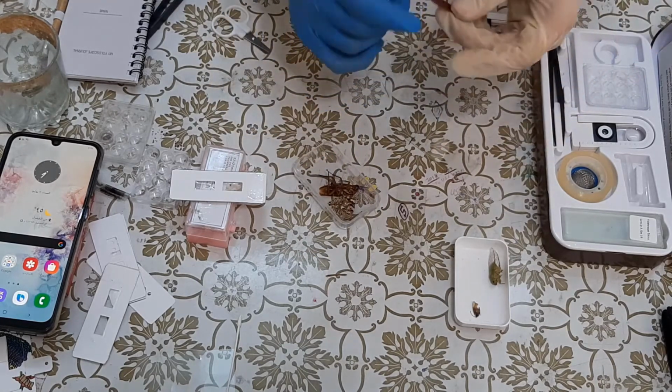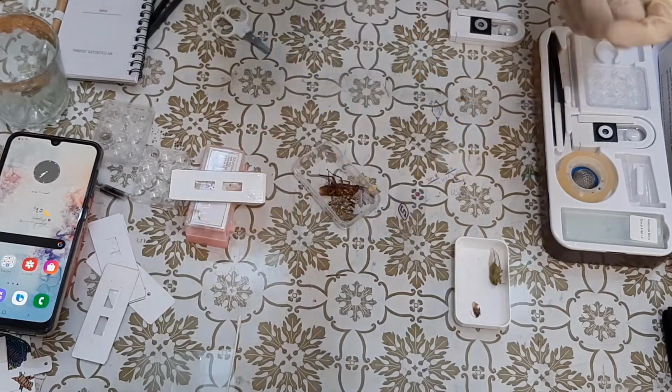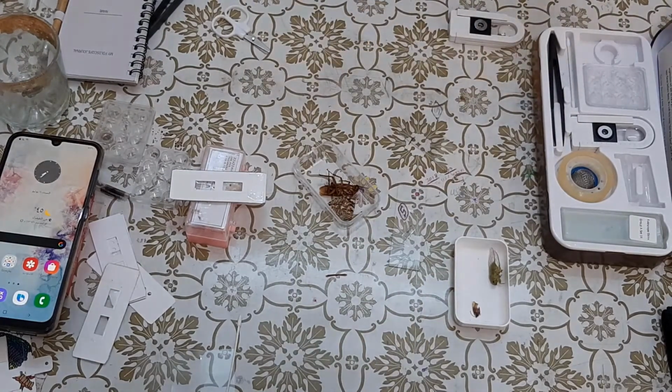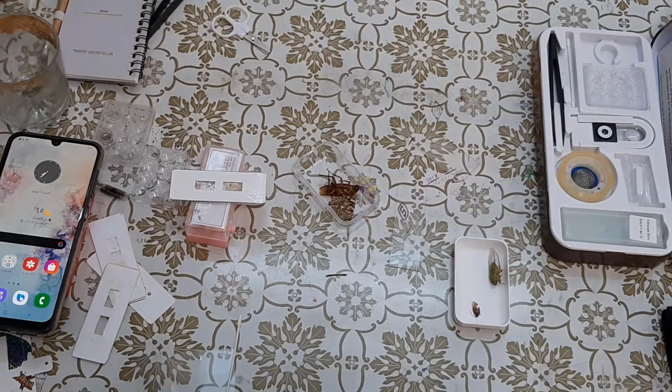So this is the wing. Again, I'm going to show you it with the LED magnifier and show you the difference, the bigger picture, and after that I will move to the Foldscope.